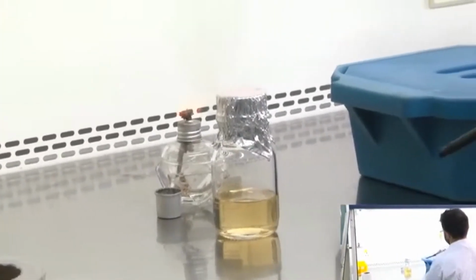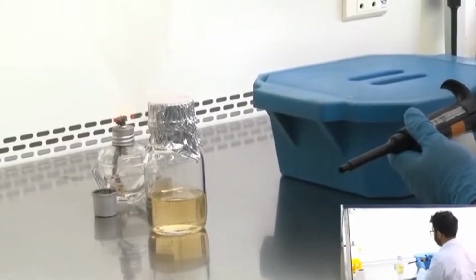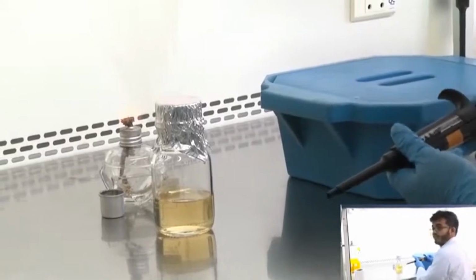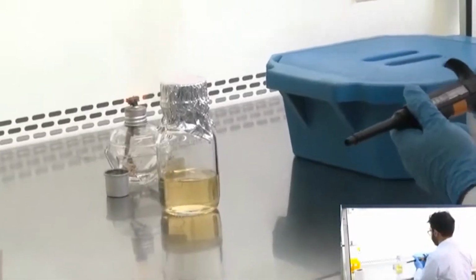What I am going to do is, I have 50 microliters of bacterial competent cells to which DNA has been added and it has undergone heat shock, and it is now being incubated in ice for roughly 5 minutes. 5 minutes is not over, it is going to be over soon. I can see it on my timer.